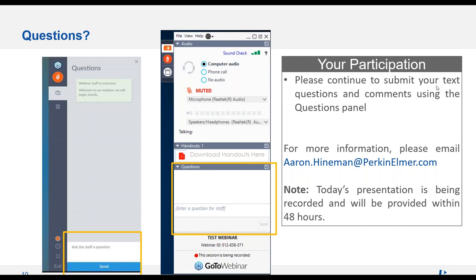One of the things that I want to try, but we just haven't had the chance to yet, is self-aspirating. Well, you have the 2000P, so that has the built-in flow injection valve. Yep. Have you tried that? Because that in theory should be a little bit better. You won't have as much time to get the sample in. I agree. I think that the 2000P has a lot of features and there's a lot of stuff you could do with it. And it's just, with COVID and everything and timing and trying to get the data out for Alex to actually get graduated.